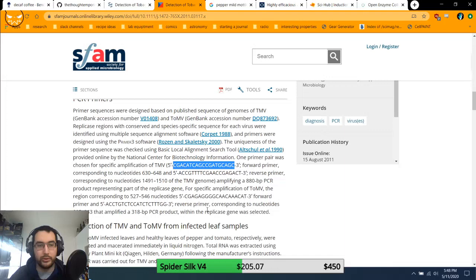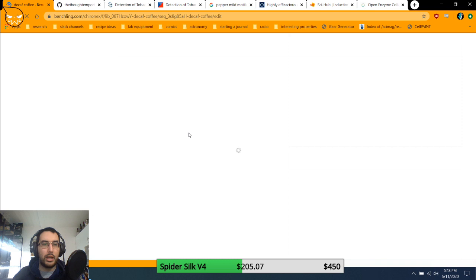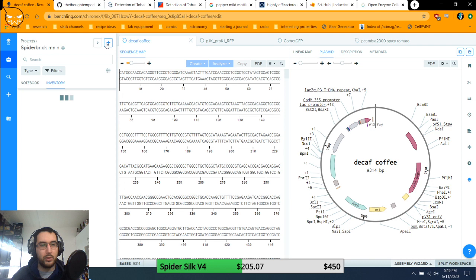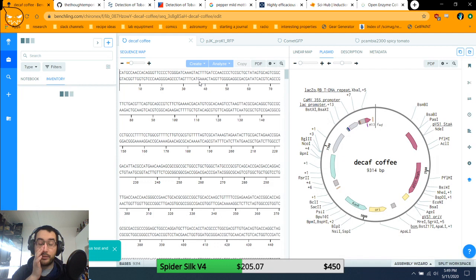So I am in Benchling. Oh, I've got to refresh the page. So I'm going to just refresh the page really quick. So for those of you who haven't tuned into one of these streams before, the website I'm using right now is called Benchling. It's benchling.com. Basically, it's a glorified text editor, essentially, like all code. So I got to go to Spiderbrick main. I'm going to make a new folder.